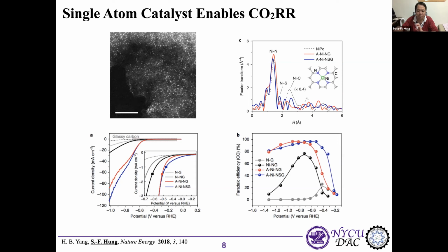Because when the material forms from the single atom, the nitrogen to nickel bonds will sometimes create some defects. So for statistical reasons, the actual coordination number cannot reach 4, which is the theoretical coordination number, because there are always defects in our materials. Okay, thank you very much.